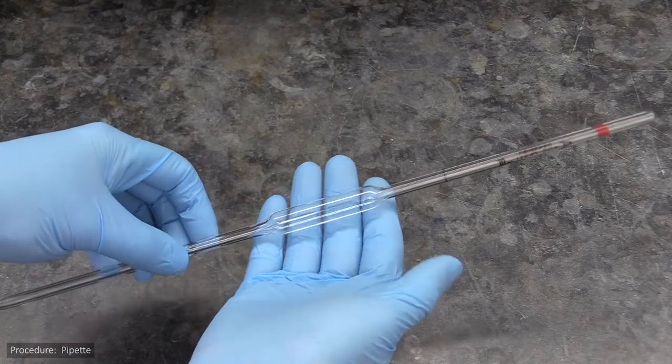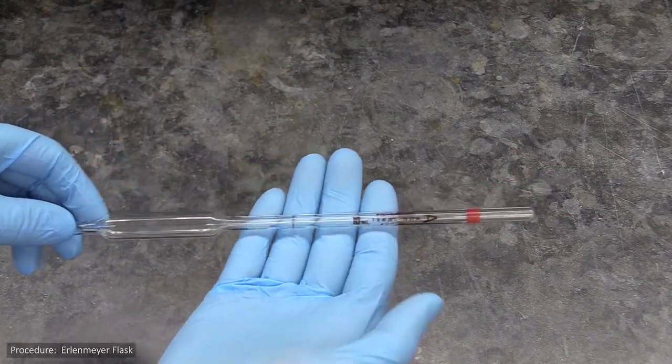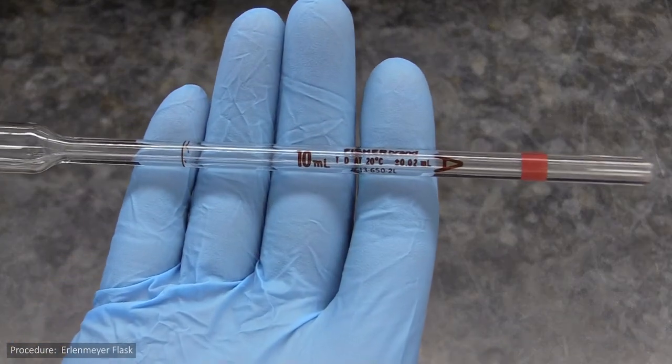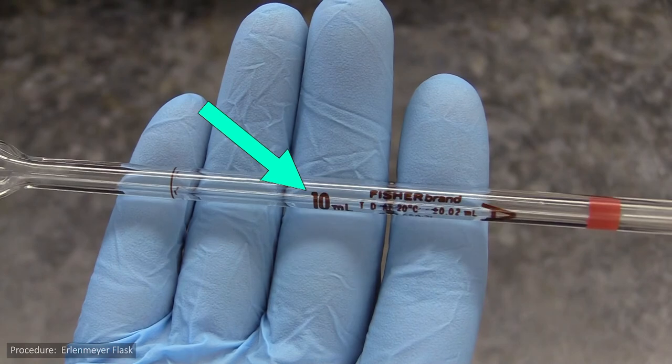You'll note that, unlike the other three pieces of glassware you'll work with, your pipette has no graduation marks to read. The amount of water you dispense with it is whatever it's rated to dispense, which is etched or painted somewhere on the pipette's side.